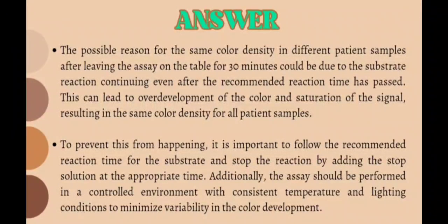It is very crucial to adhere strictly to the recommended reaction time for the substrate. Adding a stop solution at the appropriate time helps prevent the overdevelopment, ensuring accurate and proportional color representation.